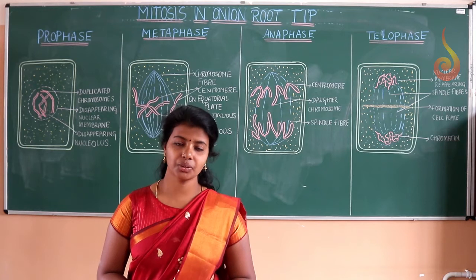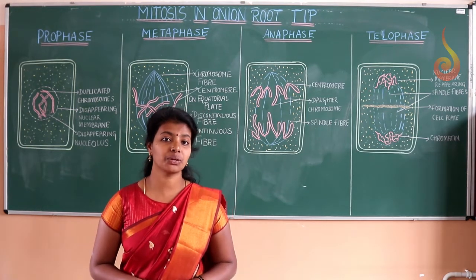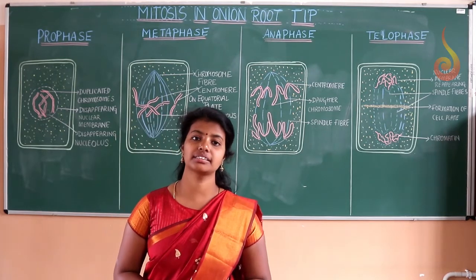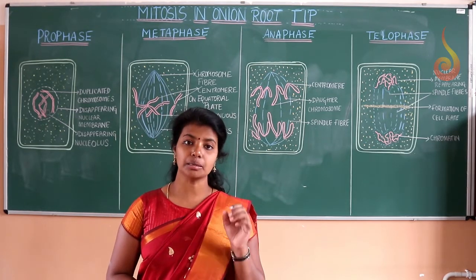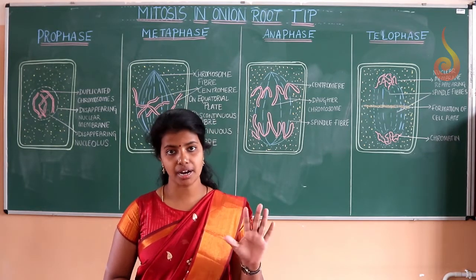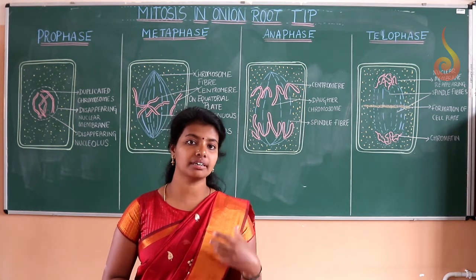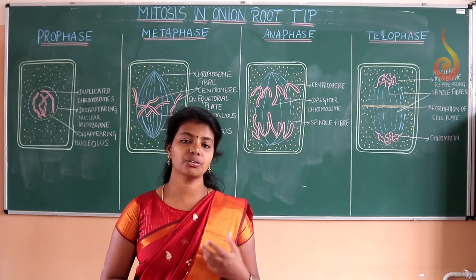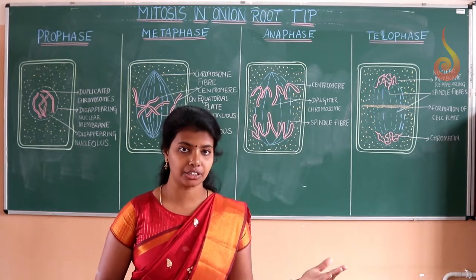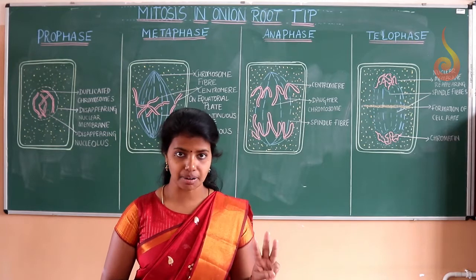Hi everyone, welcome to today's biology practical session. So today's experiment is a very important one as it is there for your exam and it is a compulsory question. It's question number 2 which carries 5 marks, and here you are going to prepare a temporary slide and study the stages of mitosis, and for this preparation of slide carries 3 marks.